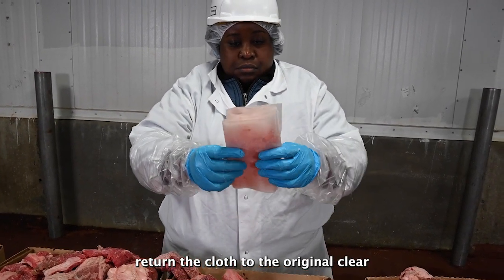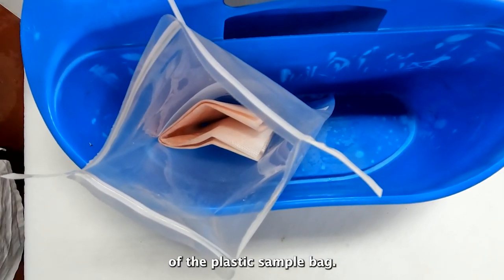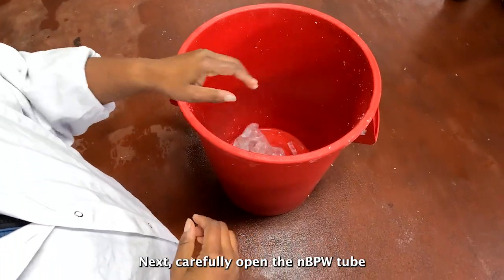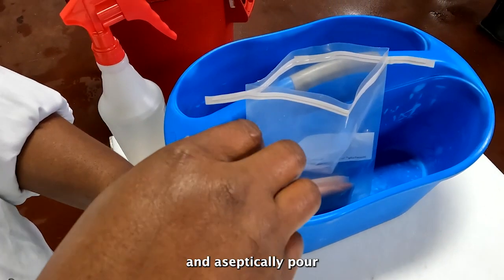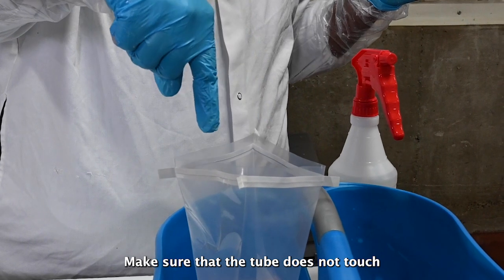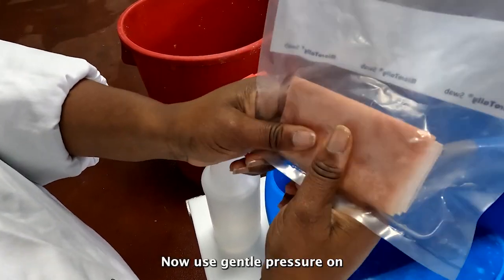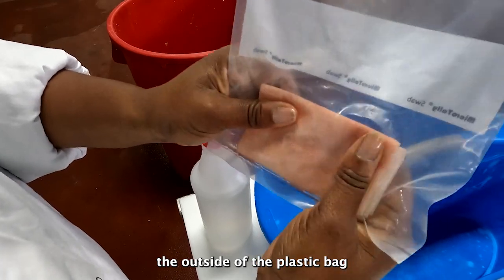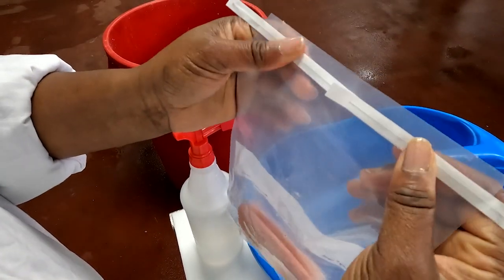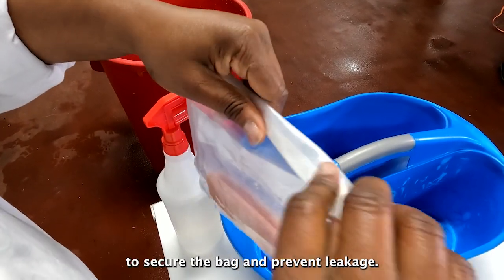Once folded, return the cloth to the original clear plastic sample bag, paying special attention to not allow the cloth to touch the outside surface of the plastic sample bag. Remove your gloves and sleeves and dispose of them in the trash. Next, carefully open the NBPW tube and aseptically pour all of the pre-chilled NBPW into the open bag. Make sure that the tube does not touch the inside of the bag or go into the bag — only the liquid buffer should touch the inside of the bag. Use gentle pressure on the outside of the plastic bag to push the cloth down into the NBPW and remove excess air from the bag. Roll or fold the top of the bag down at least three times, then fold in the wire tabs to secure the bag and prevent leakage.